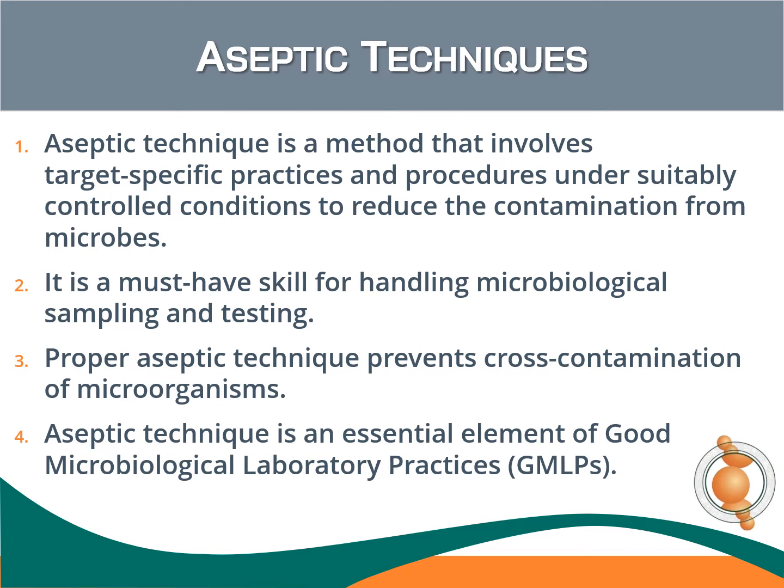Aseptic technique is crucial to microbiological sample collection. Aseptic technique involves target-specific practices and procedures under suitably controlled conditions to reduce the contamination from microbes. In short, aseptic technique is used to ensure that the sampler is not introducing any foreign microbes to the environment that is being sampled. Using aseptic technique when collecting samples is an essential element of good microbiological laboratory practices, or GMLPs.